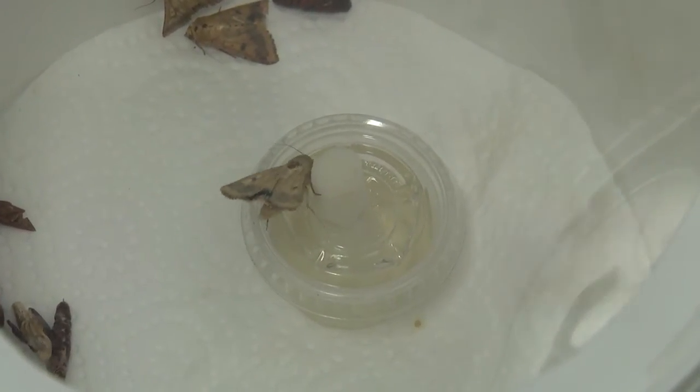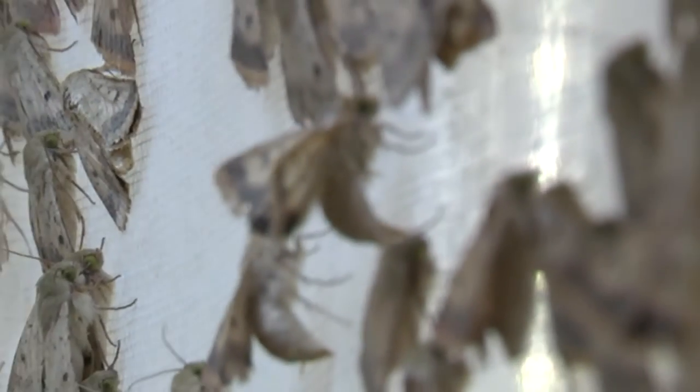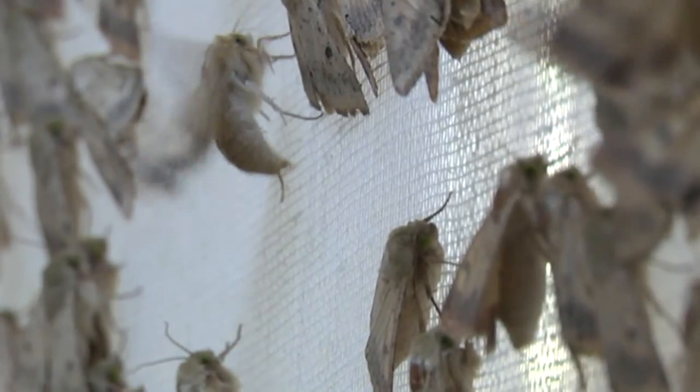The dental roll acts like an artificial flower, providing the nectar that the moths need for survival. Within three to four days after emergence the moths will have mated and will be beginning to lay eggs. The majority of these eggs will be laid on the nappy liner.